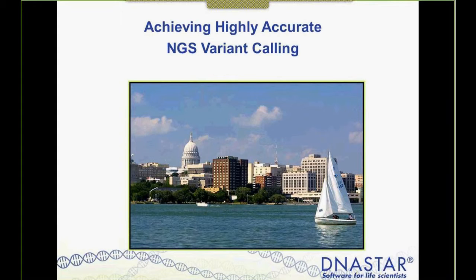And so we built that into our software so that when you get your own data, you can run an assembly, do the variant calls, and our software will calculate the accuracy for your data sets, which is a really important piece. Rather than just looking at the marketing information that I'll give you today where we ran the assemblies, I think it's really important that we put that ability in the customer's hands so they can troubleshoot their own process and have a good feel for exactly how accurate their own process is.